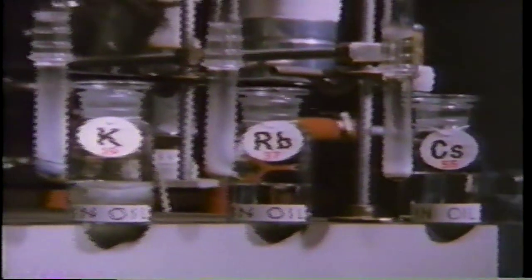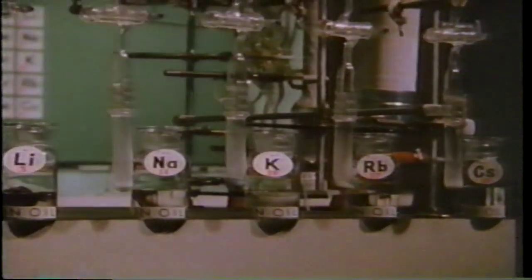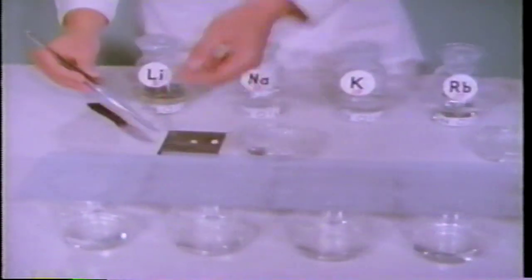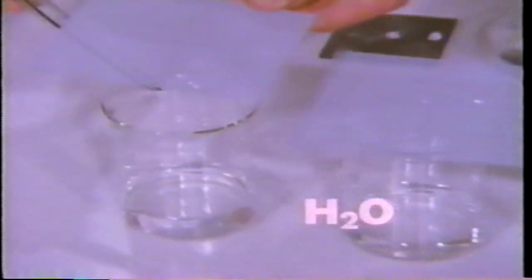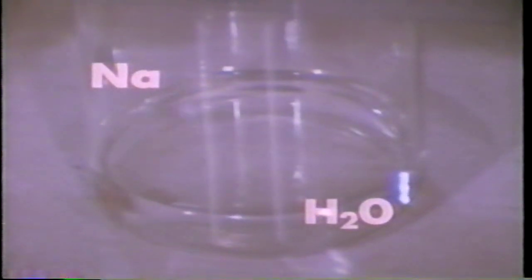All these metallic elements are stored under oil, since they react with both air and water. Let's check the reactions with water. Here's lithium. Hydrogen is produced. It dries the lithium around the surface. Next is sodium. The sodium reacts similarly.